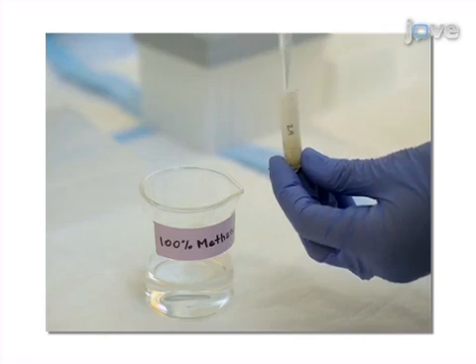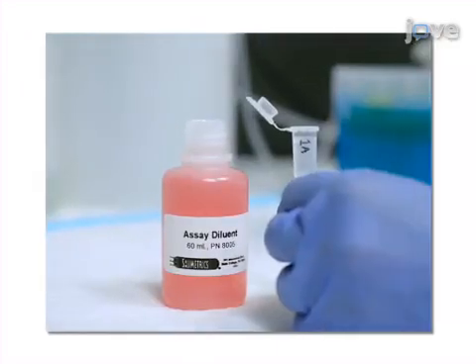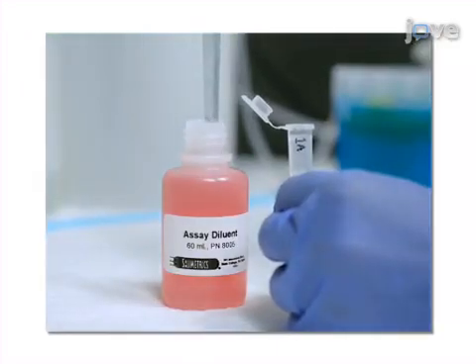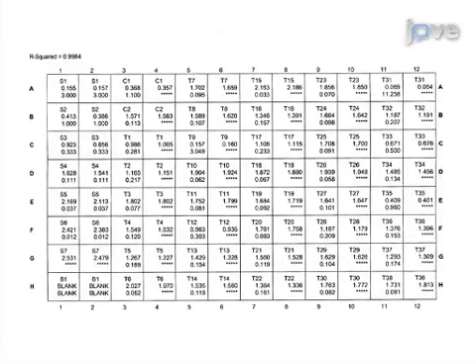The cortisol present within the interior of the hair shaft is then extracted with methanol, and the cortisol content is quantified using an enzyme immunoassay. Ultimately, the level of cortisol deposition over time within the hair sample can be evaluated.